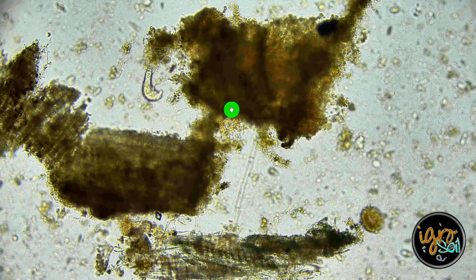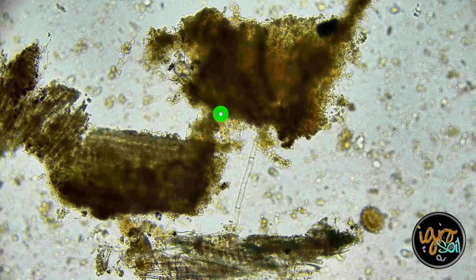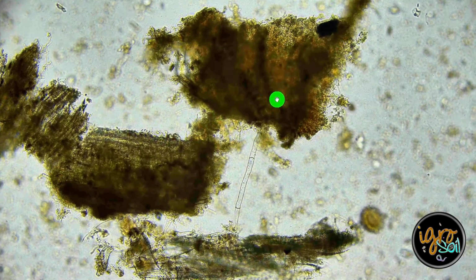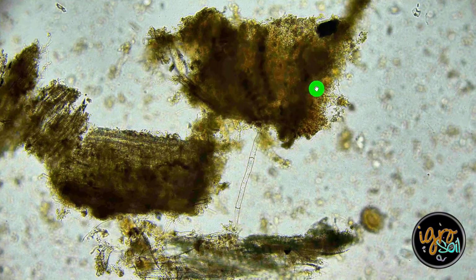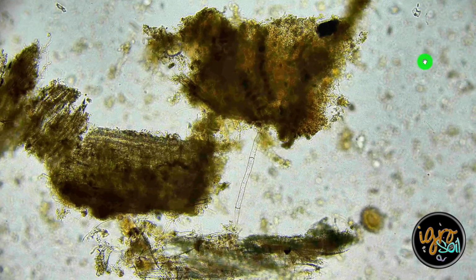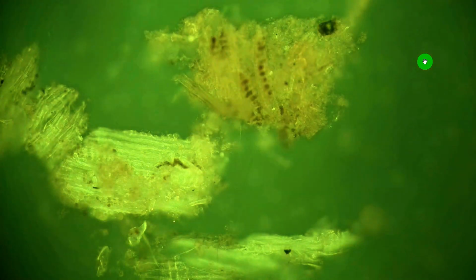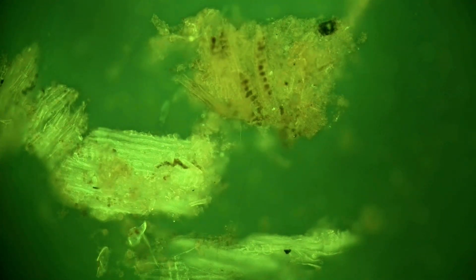Oh, we got a rotifer. I love roties. Some of my favorite microbes. I'm going to start actually growing them for aquatic systems, but that's for a later video. But you see, then it's bouncing here, and then look, whatever in here is red. You see that? So I want to light that up and see what happens there. That's just a good looking piece of organic matter. And then look at the color of this here. Wow. So that's the green that I'm telling you about that supposedly is phosphorus, right? Or some other type of mineral or nutrient.